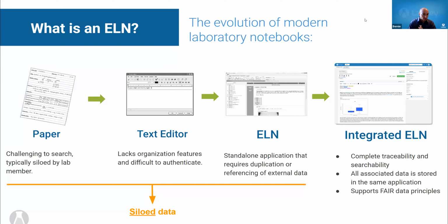Anyway, let's move to our zenith, I guess. So an integrated ELN. An integrated ELN means that there is no separation between your data capture and storage and the notebooks. They are one software. There are a variety of manifestations of this, everything from capturing data through the ELN as that primary interface to LIMS and other data management systems that have a built-in ELN that's capable of accessing all of that data therein.